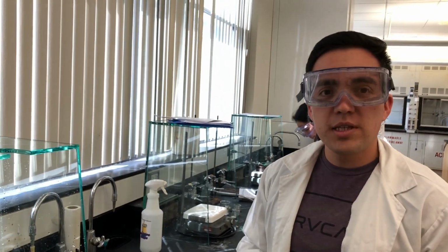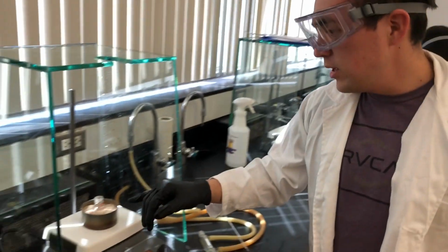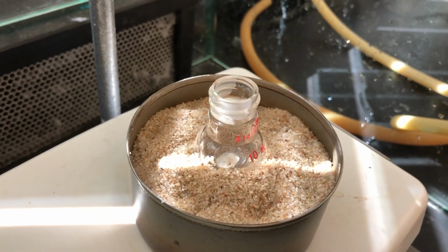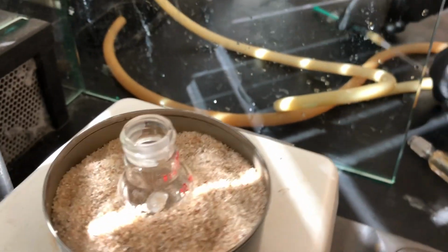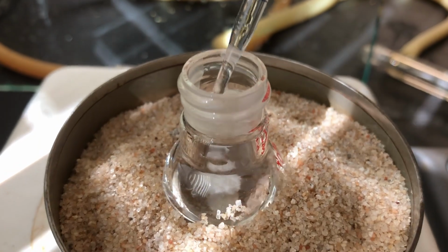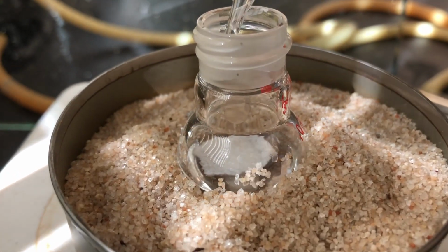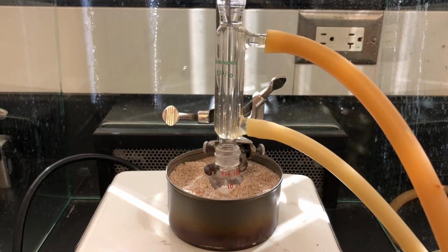Okay, so this is the first step of the aspirin lab. Right here we have 3 milliliters of sodium hydroxide, and I'm going to add the 0.3 milliliters of the methyl salicylate. Notice how it precipitates right as I add it. So that was the 0.3 milliliters of methyl salicylate.